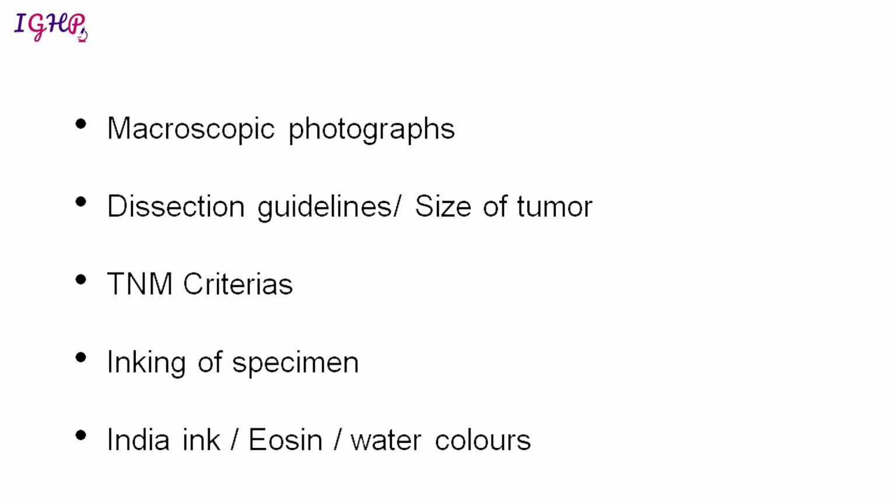So if you have read your TNMs carefully, then you will be wiser in calculating the size of the tumor, and you will be wiser to look into those areas that will be important from the protocol point of view. You should ink your specimens as we have discussed, and inking we have already mentioned.